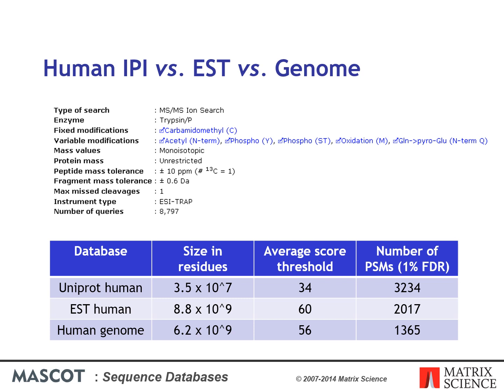One reason is that a proportion of the potential matches are missed because they are split across exon-intron boundaries. Based on an average peptide length, approximately 20% of the matches will be lost for this reason. In this particular example, the difference is much larger than 20%. The other factor is that the human genome is only 1.5% coding sequence and represents a single consensus genome. EST is 100% coding sequence and represents a wide range of SNPs and variants.